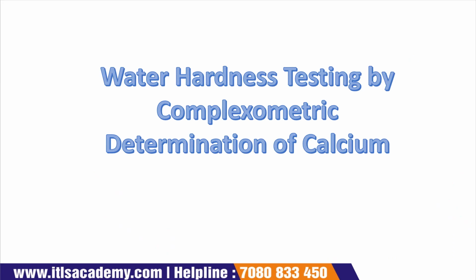Today we are going to discuss the topic of water hardness testing by a complexometric determination of calcium. What we have to do is determine the water hardness, and along with it, we have to determine the calcium.